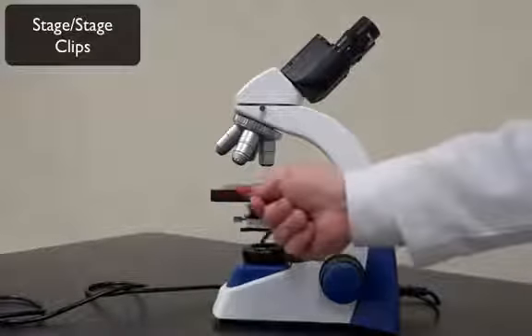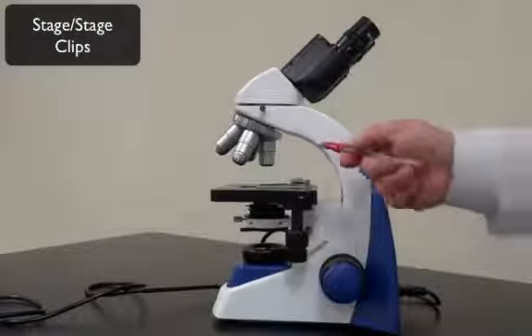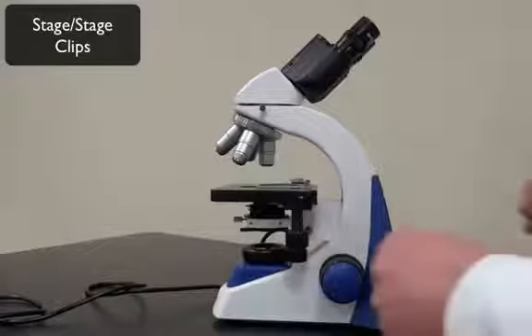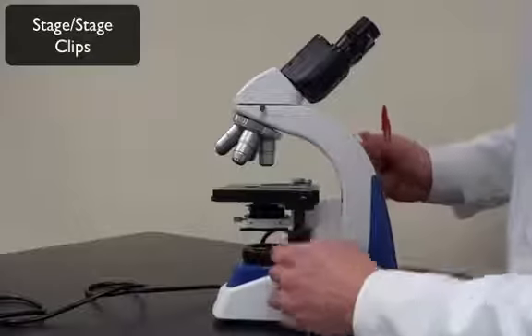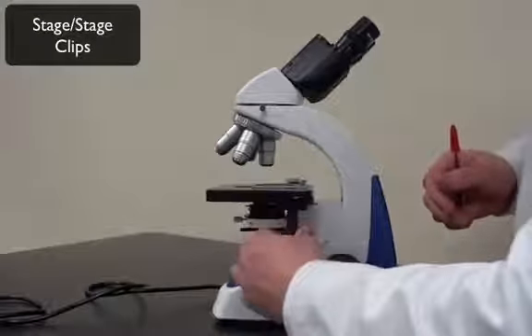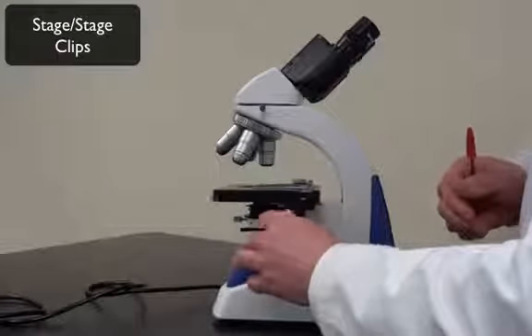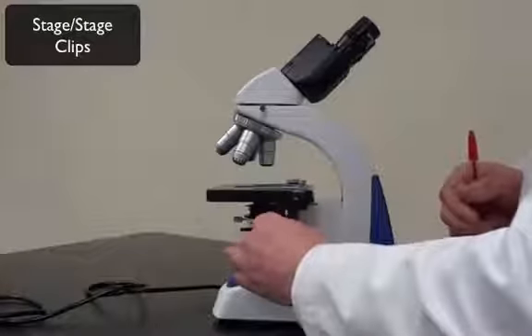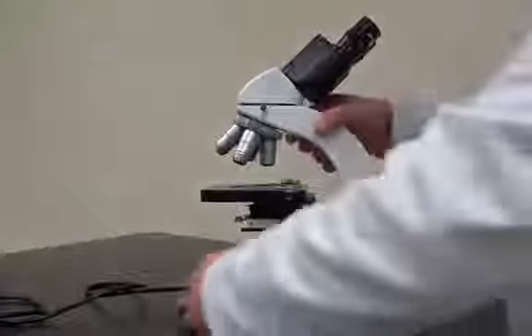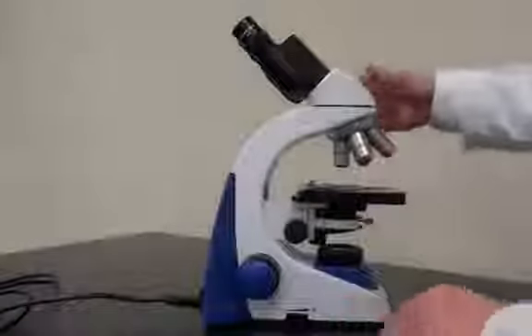Now you'll also notice this black stage here. This is appropriately referred to as the stage. And with the stage then we have the stage clips, which I'll get to here in a second. The stage clips ultimately lock or hold the slide into place that you're viewing. And these little dials will turn the stage clips either left and right or up and down. So we can move the slide basically this way here. Okay? I'm going to rotate the microscope around here. Things view on this side here.